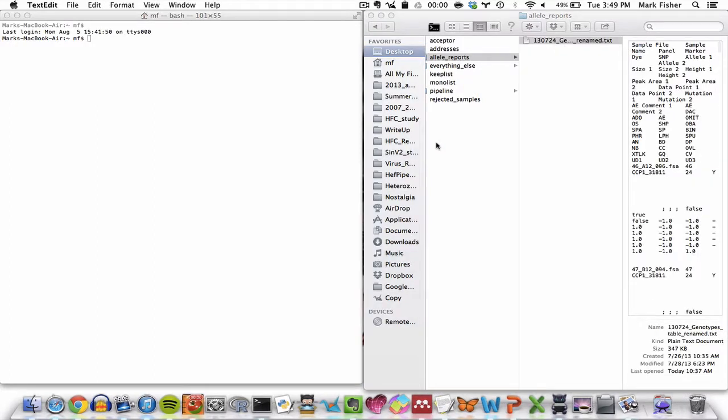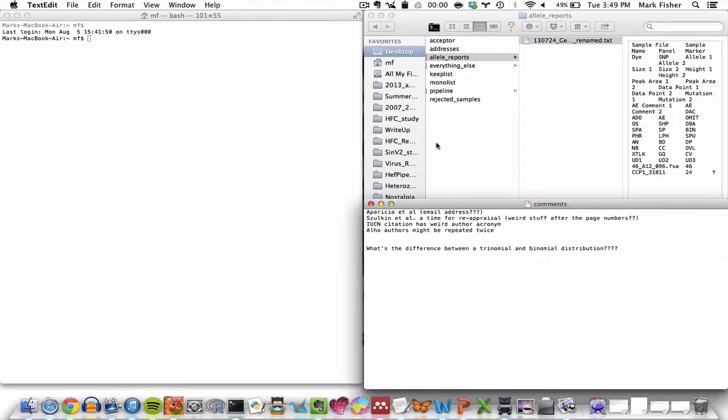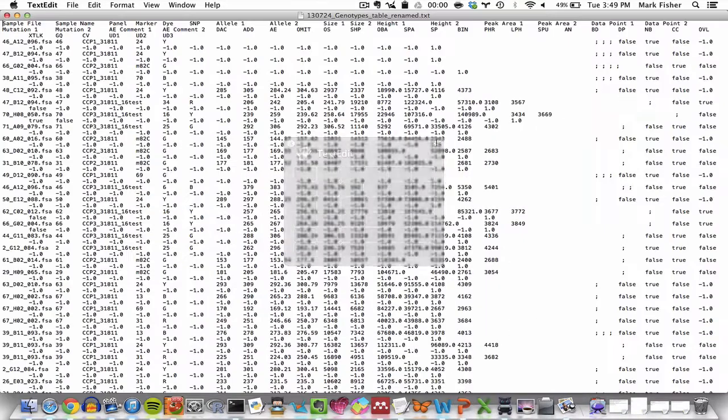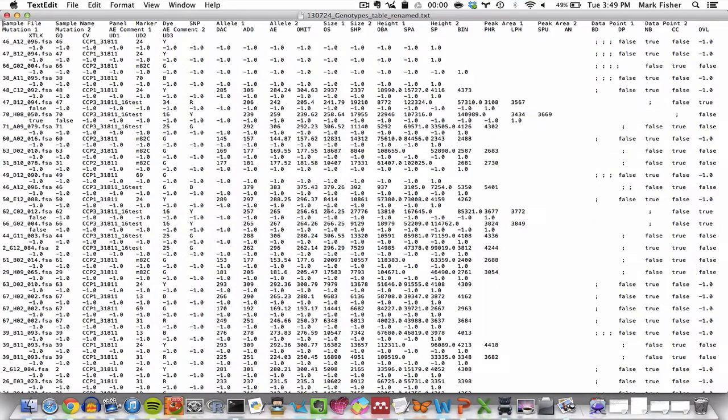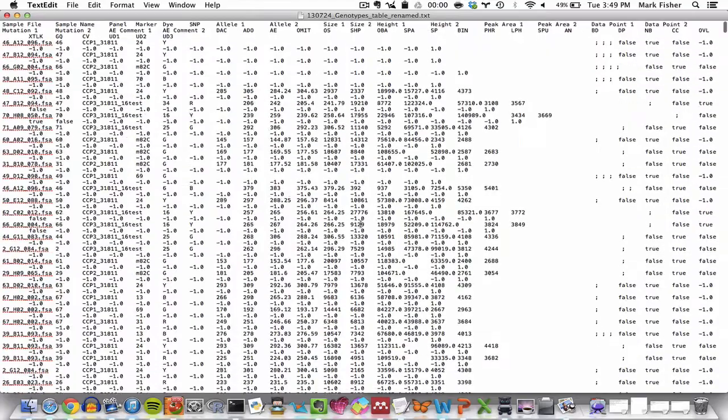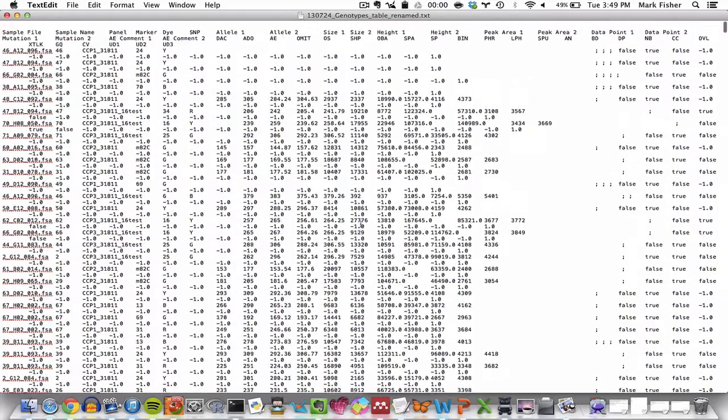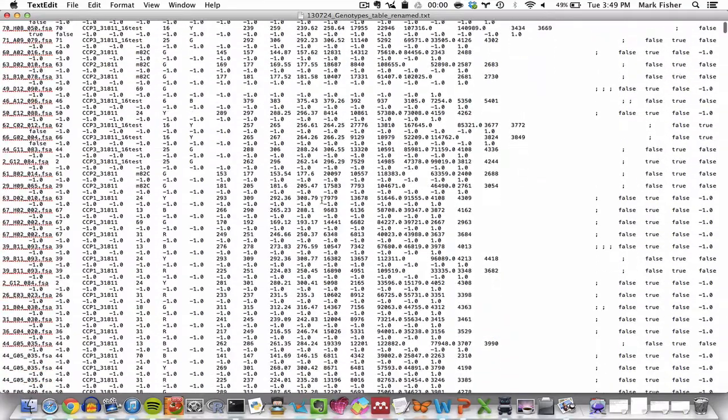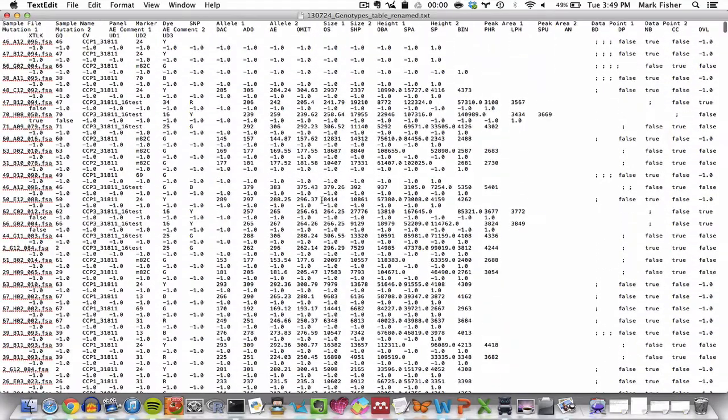So I open it. And this is what GeneMapper formatted files look like. If you're watching this tutorial video, it's probably because you're quite familiar with them.